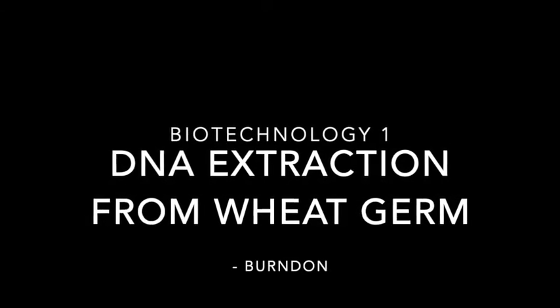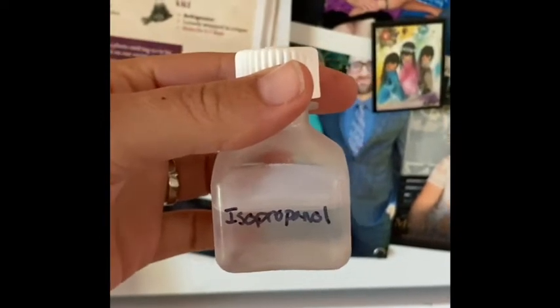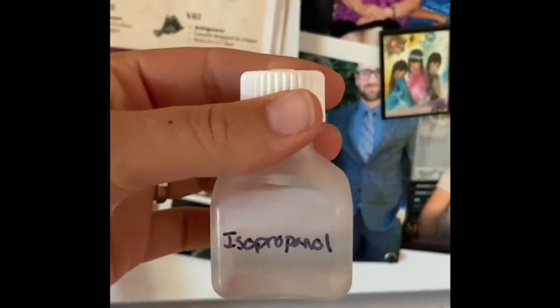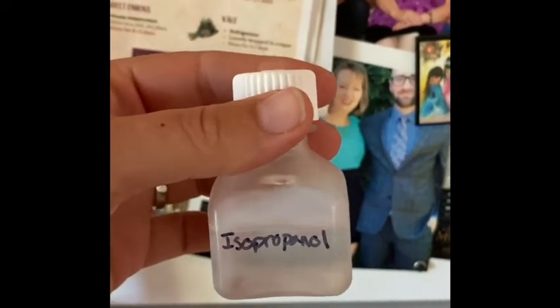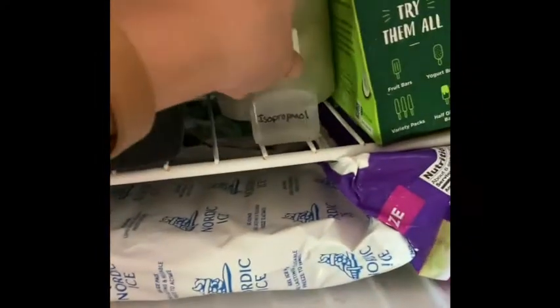Welcome to the wheat germ DNA extraction lab. The first thing you want to do is take your isopropanol, which you may have in a tube or a little bottle, and put it into your freezer for at least an hour but preferably overnight. Just tuck it in your freezer — you want it to be really, really cold.